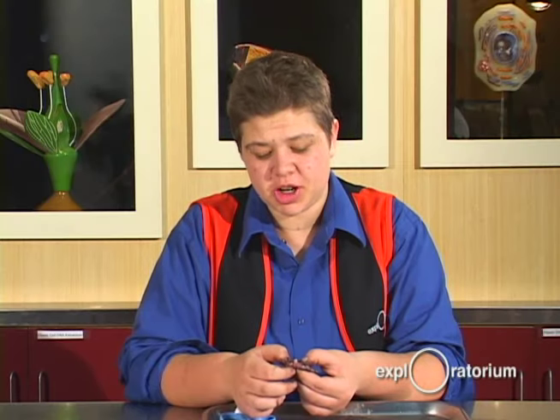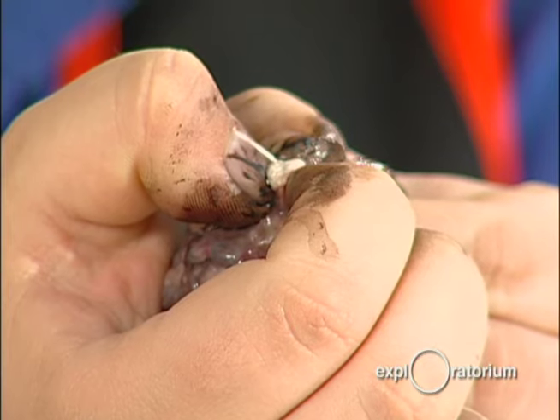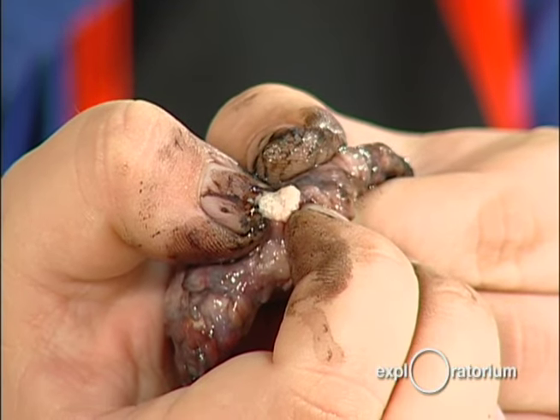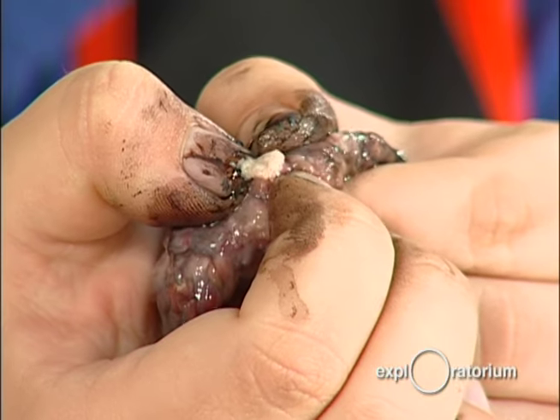Your retina actually becomes the optic nerve — this right here is the optic nerve. I'm going to squeeze it so we can take a closer look. That white goop is the myelin surrounding the optic fibers. Your brain receives information from the cells in your retina and turns that information into a picture of the world.